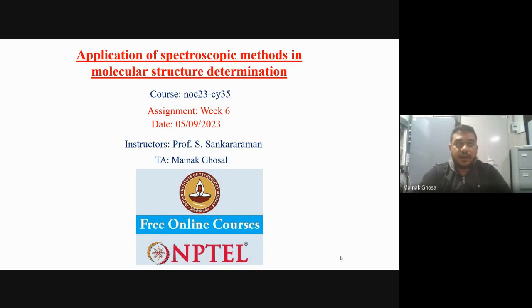So in the previous five weeks, we have seen that if any NMR data or any mass data is given, we can analyze the spectrum and identify which kind of molecule it is, and from the mass we can also identify what kind of fragments are present in the molecule. That we have seen in the previous five weeks.